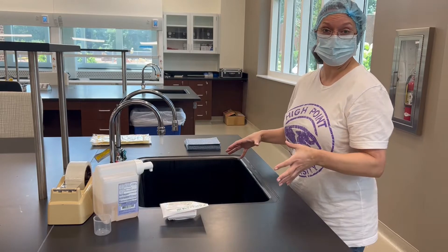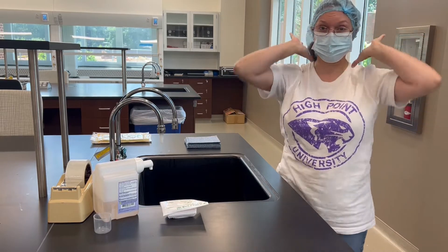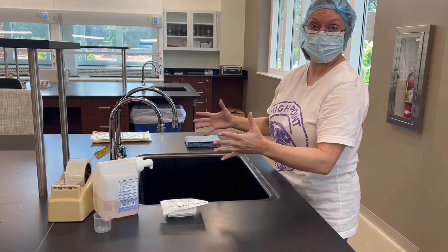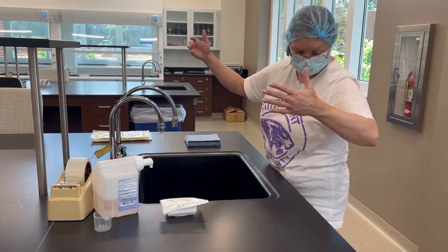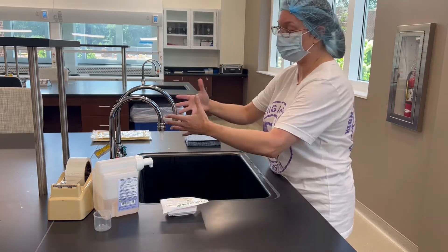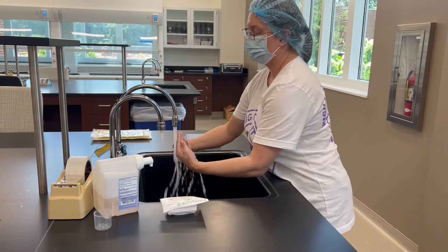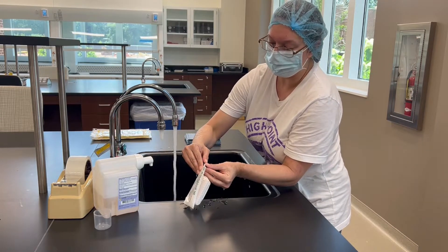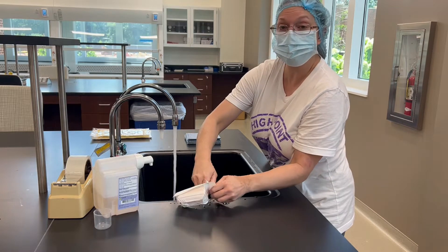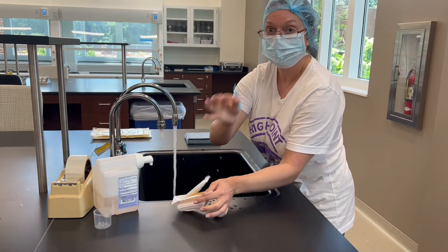We're using this sink as a demo to wash your hands. You put on your face mask, your cover, your shoe booties, and now we're at a sink. Realistically there would be a motion sensor or something you knock your knee against to turn the water on. We're going to wet our hands first, put a little bit of soap, and clean the nails using a nail pick.